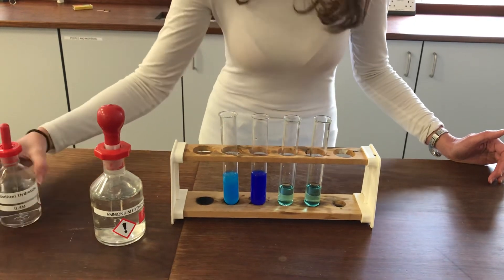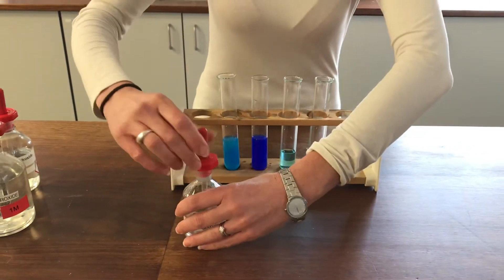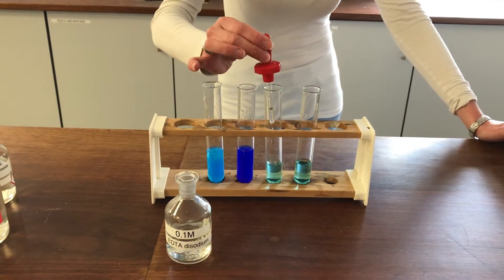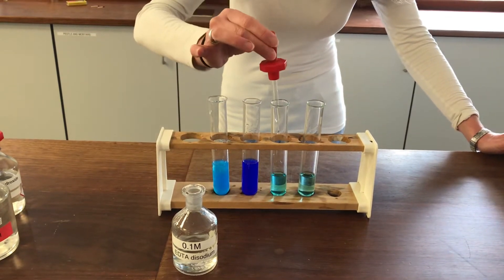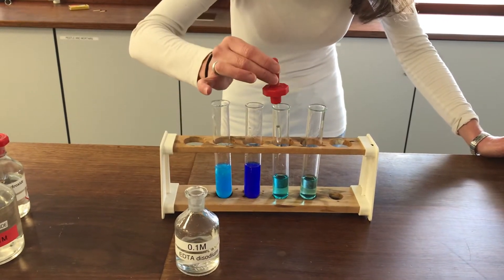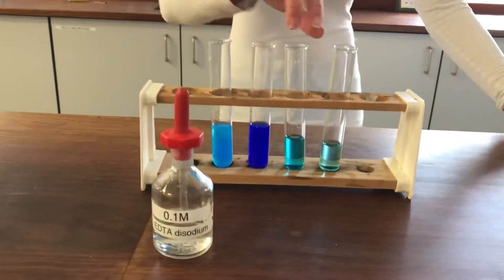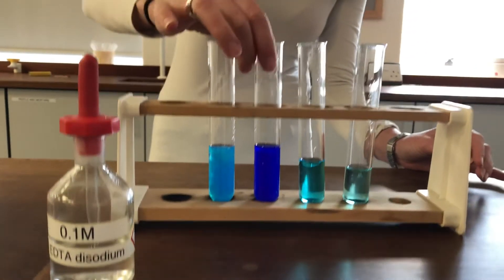I'm now going to have a look at what happens with a new ligand. This is called EDTA — it's a hexadentate ligand, meaning it's got six different lone pairs of electrons that can form dative covalent bonds with my copper complex. So we're expecting the water ligands to be displaced in a ligand exchange with the EDTA. You might like to think about what would be the driving force for shifting six water ligands out and replacing them with one hexadentate ligand. It's a very subtle colour change from the original blue — a slightly richer, slightly more intense blue, but nothing like as intense as with the ammonia ligand.